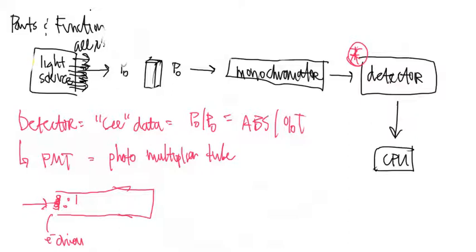Okay, and then there's going to be other plates in the photomultiplier tube that's loaded down with electrons as well. So it's going to hit that plate, and it's going to knock more electrons off, and that one hits that plate and it knocks more electrons off. And then there's going to be another plate with more electrons, and then that one hits and knocks more off. This one now hits, knocks more off. And this will keep going and going. And then by the time that you're done, you have amplified the signal because it's electron driven. That's why we call it multiplier tube.